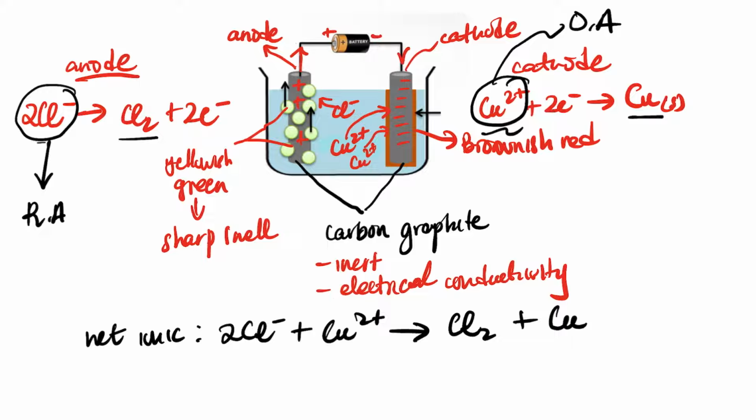And guys, what is important: if you look at the color of the solution, it is blue. What causes that? It's the copper ions. Now, very important, the copper ions are blue in color. So just like what is happening here, the copper is reduced.